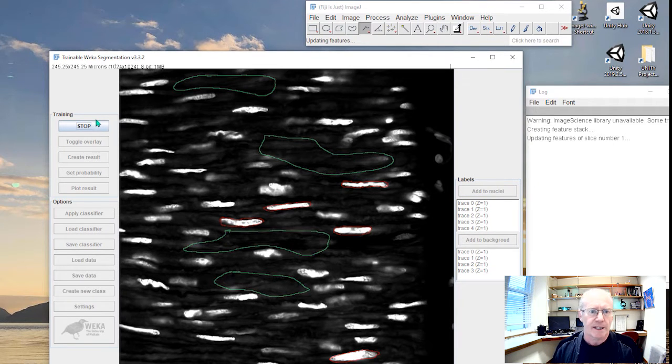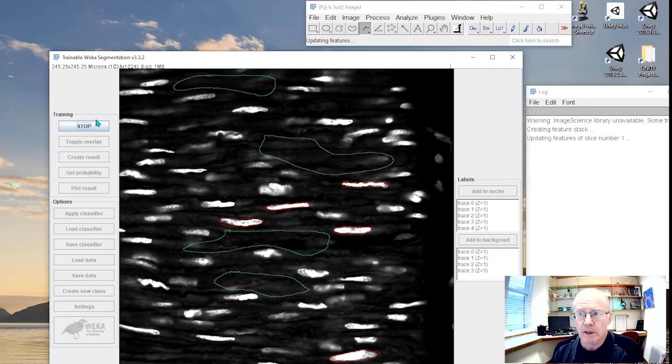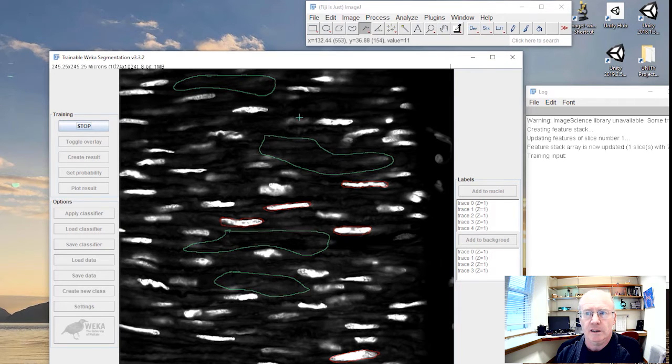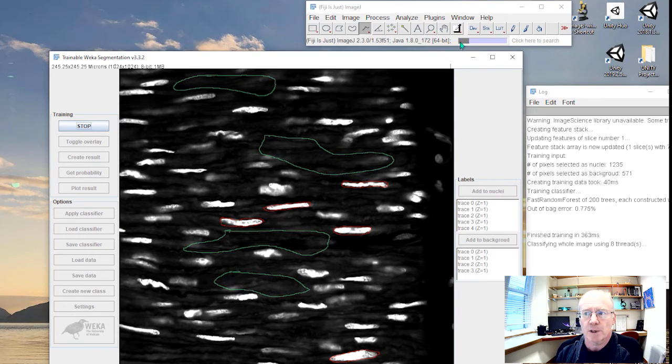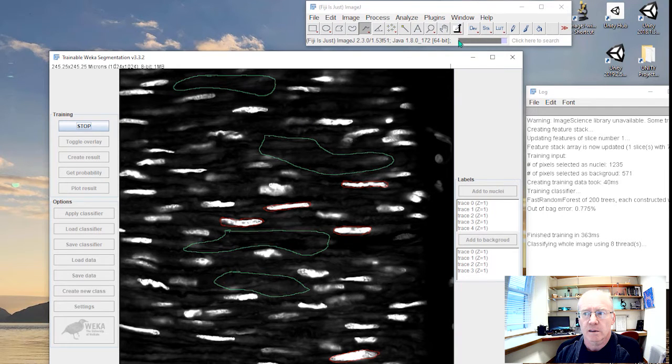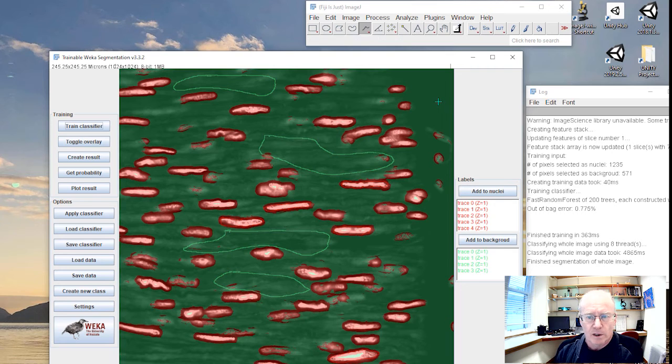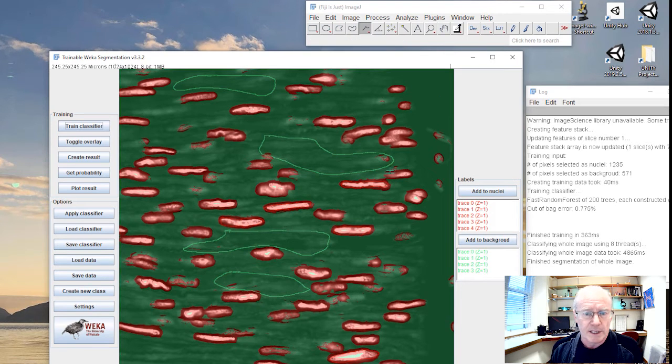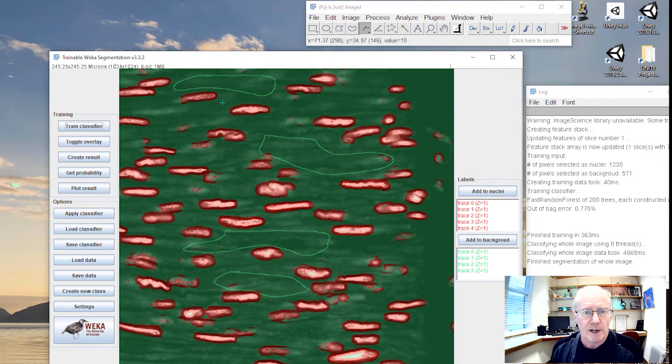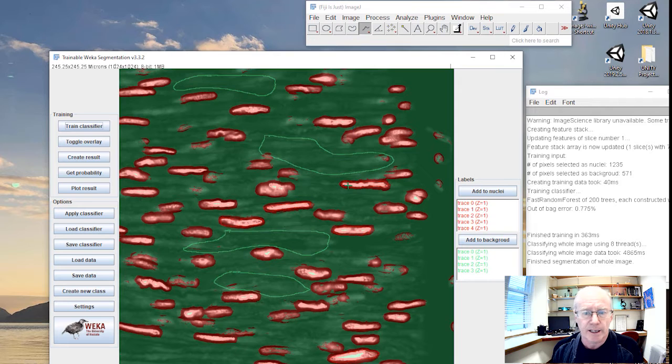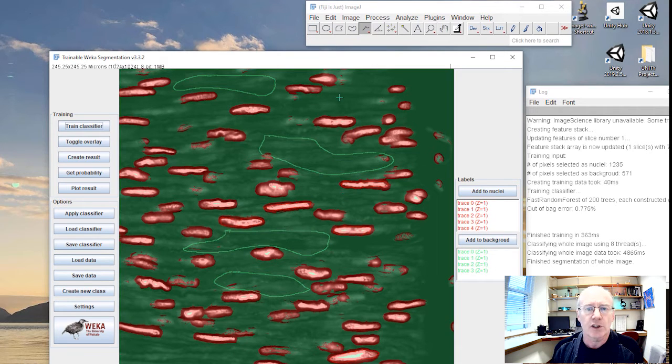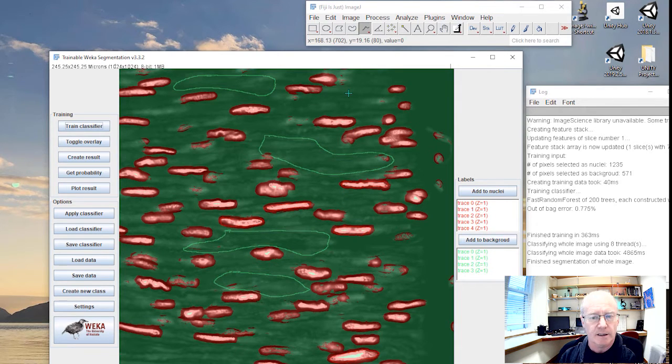And it takes not long actually, a few seconds. Eventually we'll see something happening up here. Now it's done a fairly good job. It's identified all of these red objects as nuclei and everything that's green here you see as background.